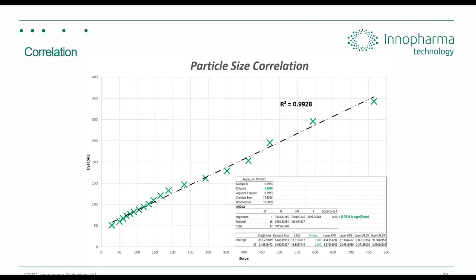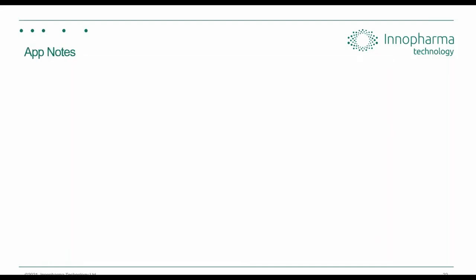So we were able to tell from just looking at our regression values whether the relationship between ICON and Sieve is statistically relevant. And for that, we ran a statistical correlation test. We seen that P was below 0.05. So that gave us a 95% confidence interval that this data was statistically significant.